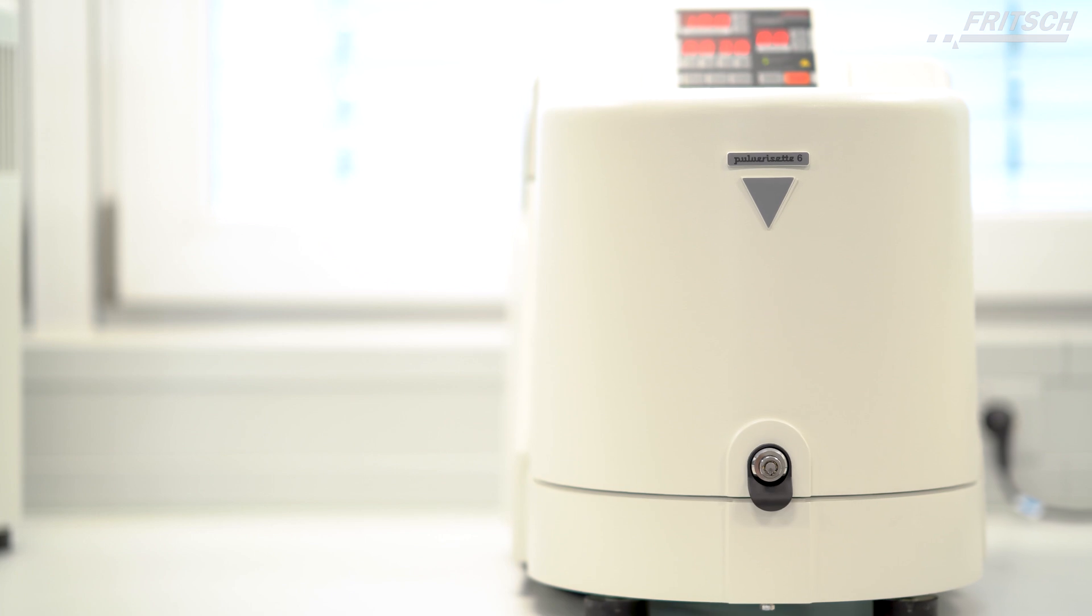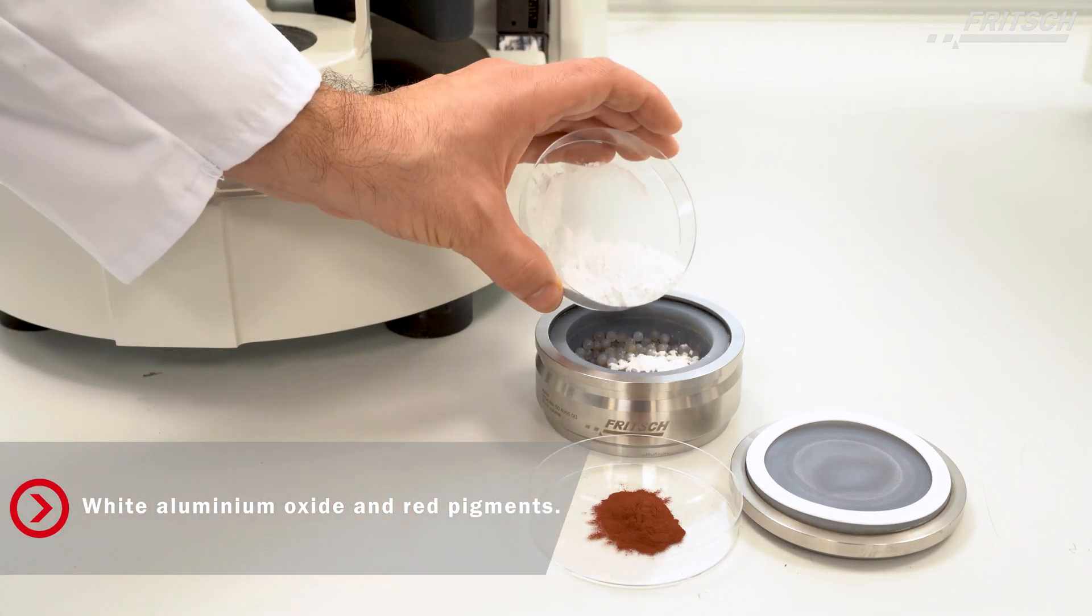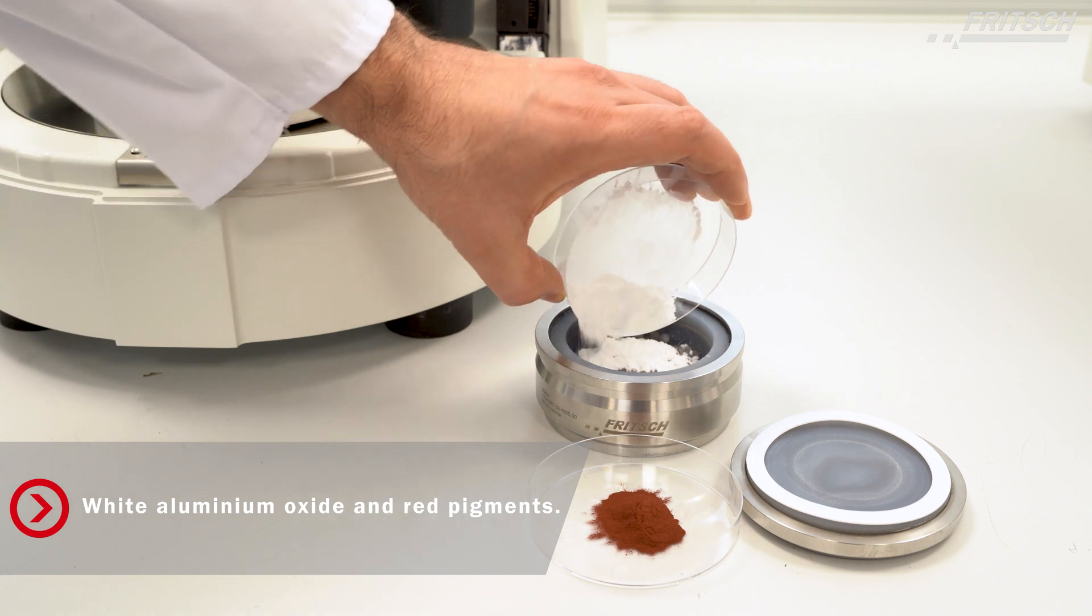We will mix two samples in this application using the Pulverisette 6 classic line. In this case, we will mix aluminum oxide and some pigments.